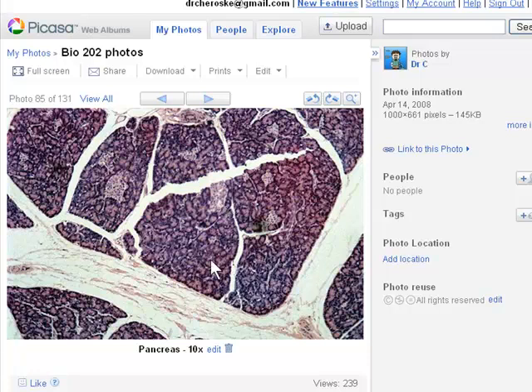So when we look at the pancreas, we see a lot of these dark purple dots, and then every once in a while, it looks like somebody dropped bleach on the slide, right? These bleached out areas are the pancreatic islets. They have the alpha, the beta, the delta cells, etc., that are part of the endocrine system to secrete insulin and glucagon, somatostatin, etc. Okay? So the bleached out areas are the pancreatic islets. They're characteristic of the slide, make it easier to identify, but it's not the part of the slide that we're focusing on right now because those are endocrine in function.